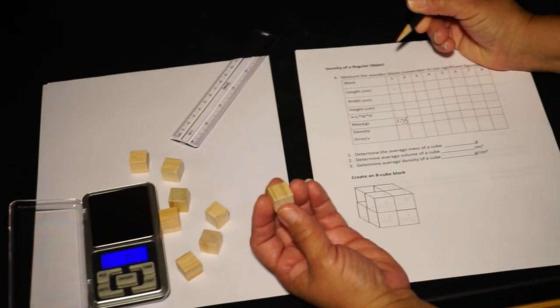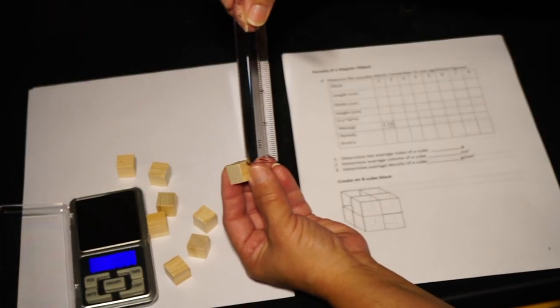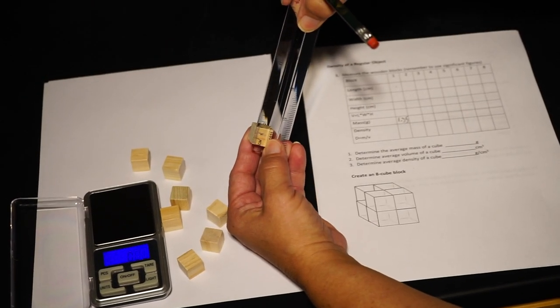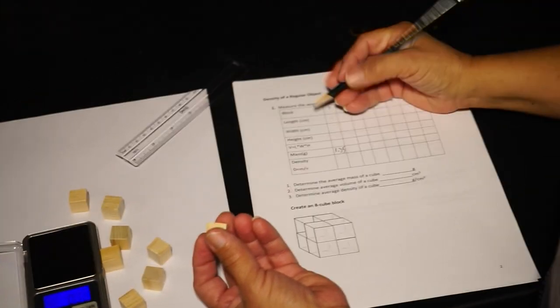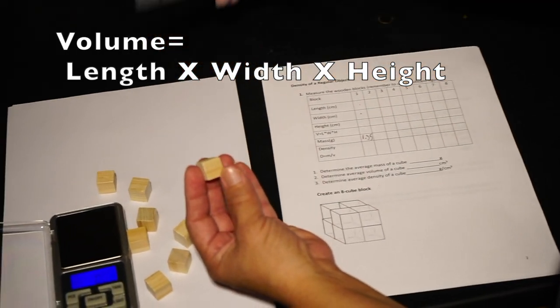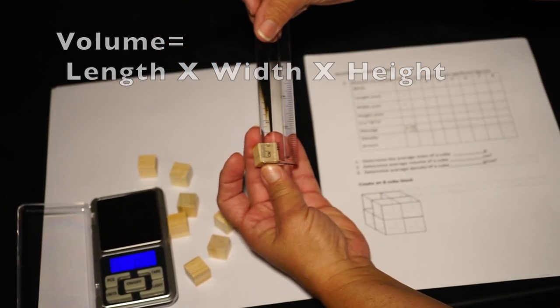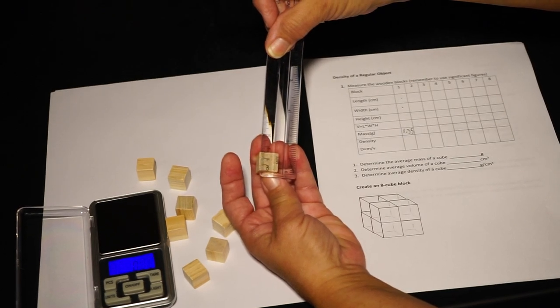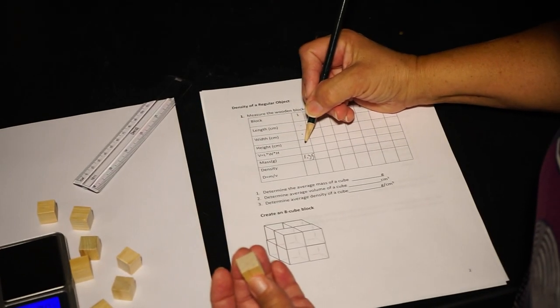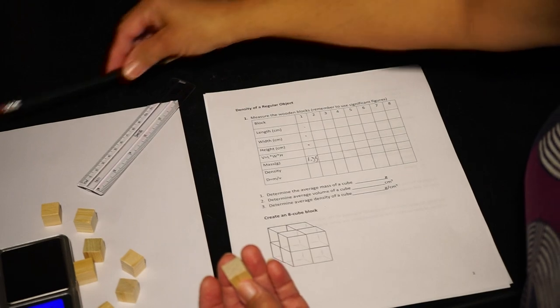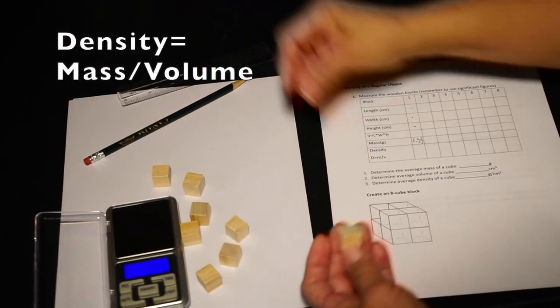Repeat this for all eight blocks. It can help to label each block one through eight to keep track of them. Then you'll calculate the volume of each block. To do this, just multiply the block's length times its width times its height. Do this for each of the eight blocks.